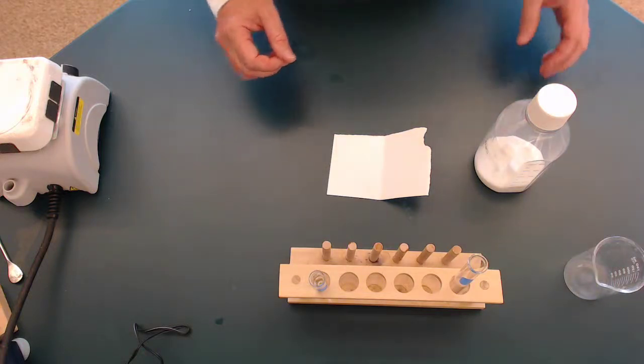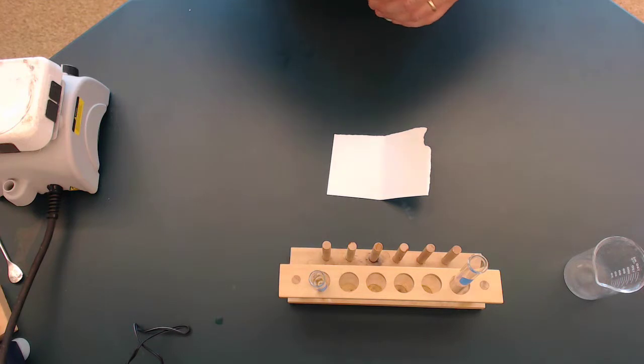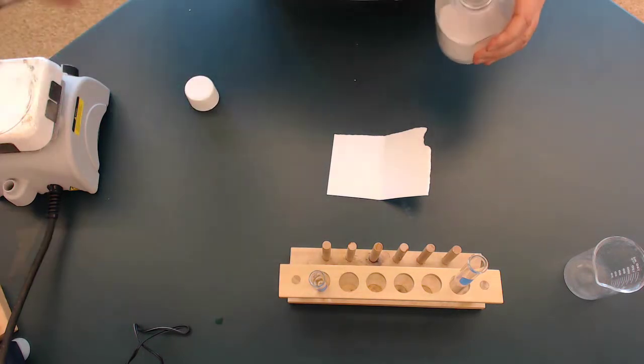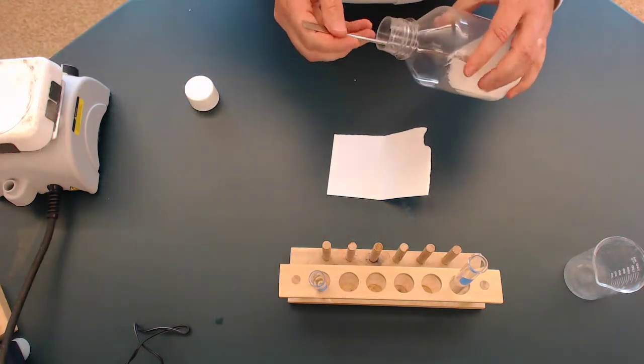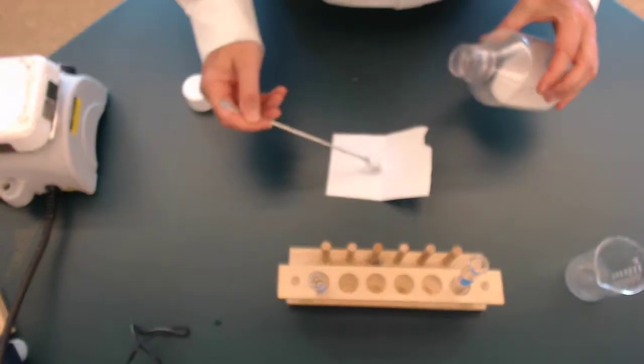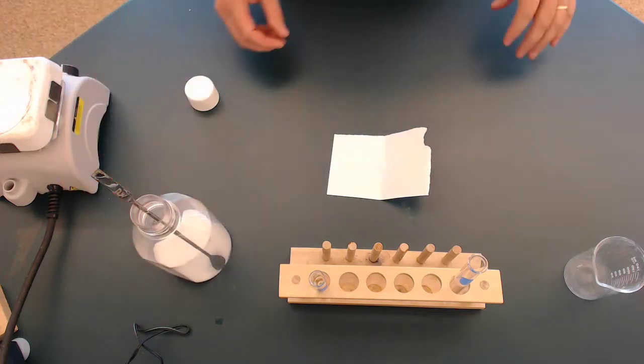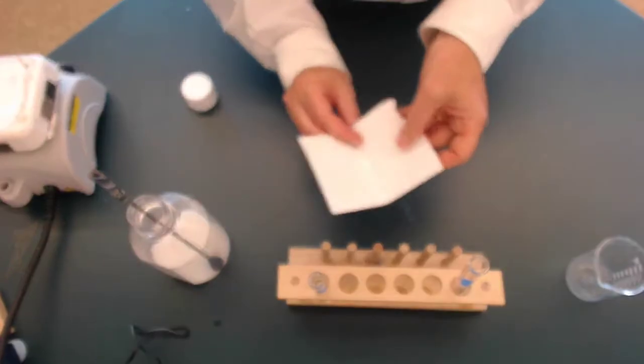So in the first part of the lab, what we need to do is take NaCl, which is salt, and we're going to take a pea-size amount. You notice that salt, as you know, is a solid. So there's a pea-size amount right there, probably a little bigger, a little more than I need. And we're going to put it into a test tube.